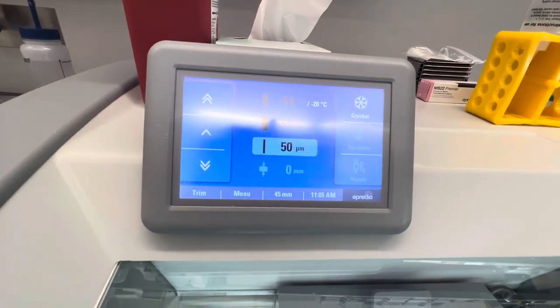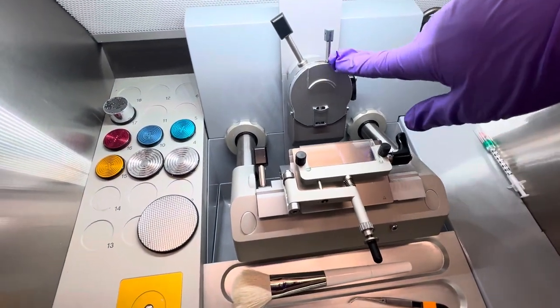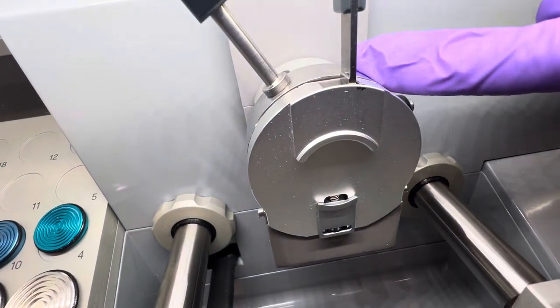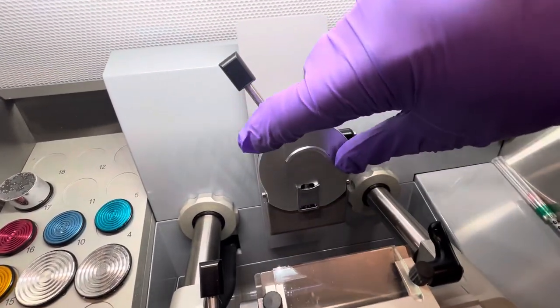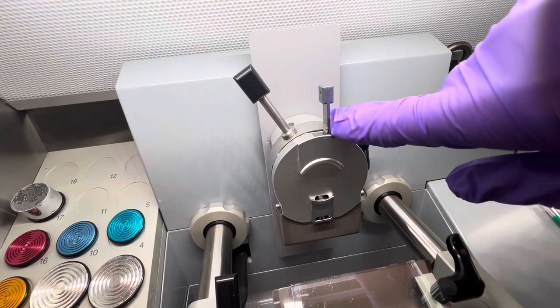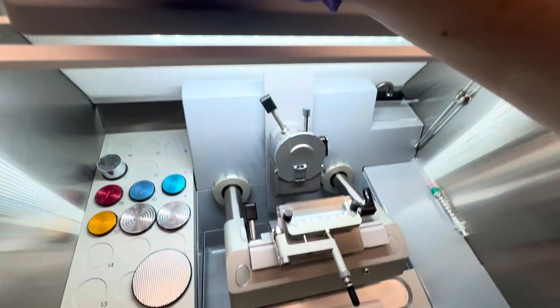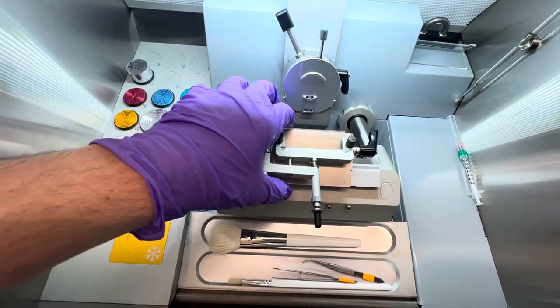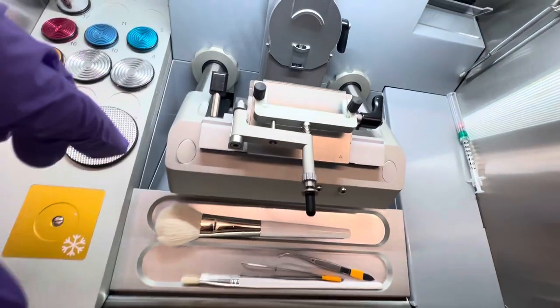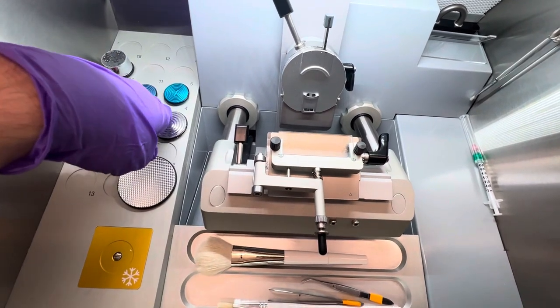To go over the parts, it doesn't look like anybody's working on this right now, and there's no marks. When I say marks, you can see there's a bit of Sharpie still left over. Sometimes whenever you don't finish in one day, you leave a mark so that you can make sure you place the block in the same spot. So there's the bit where the Sharpie's left over. However, this looks like it's all the way back already. I'll double check. Yeah, it seems so. In any case, this is the knife stage, and I won't move anything else in case anybody's working here, but it doesn't seem like it. Yep, neither of those are being used.